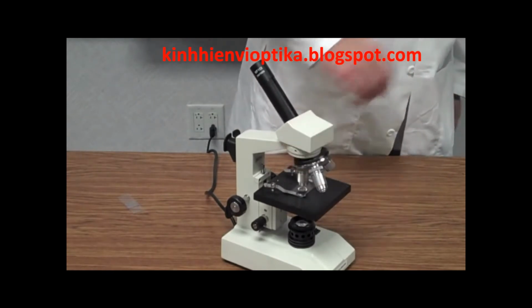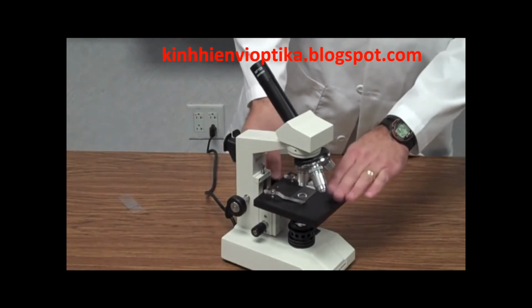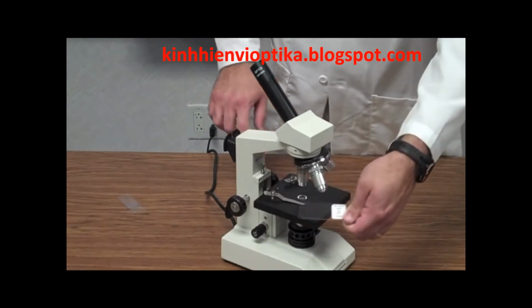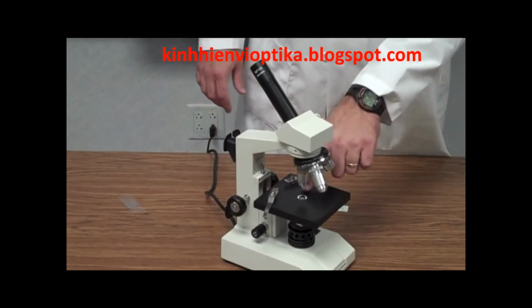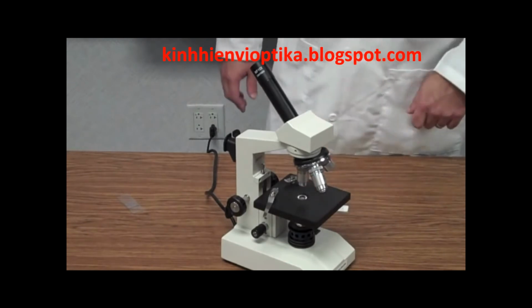Okay, working our way on down. This big black area is called a stage. Okay, this is where you place a slide, whatever specimen you're looking at. You place it on the stage. In the middle of the stage there is a hole. That's very important because that's where the light shines through.